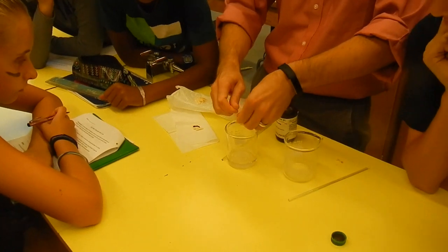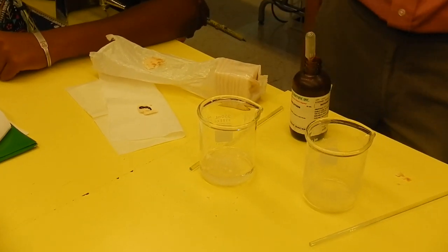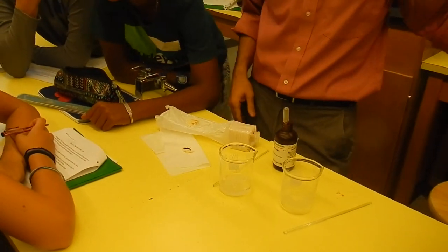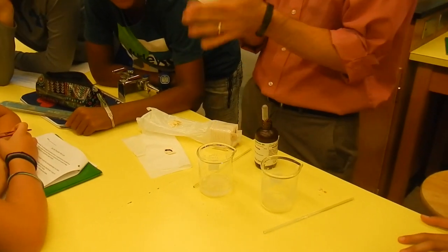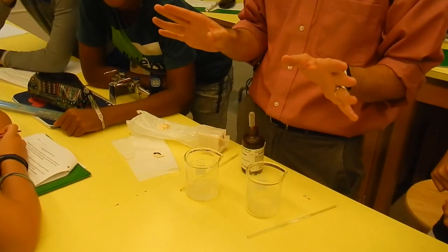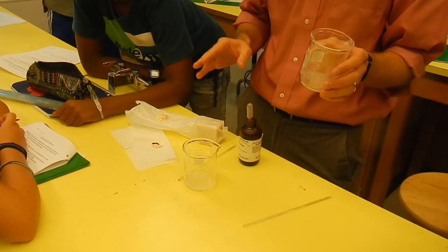In this one, I'm going to put amylase. Does anybody have amylase that I can put in here? Now, I need to borrow your amylase. Okay, I'm serious, totally serious. For this lab to work, Bill. Watch carefully the demonstration. Okay? Watch carefully the demonstration.